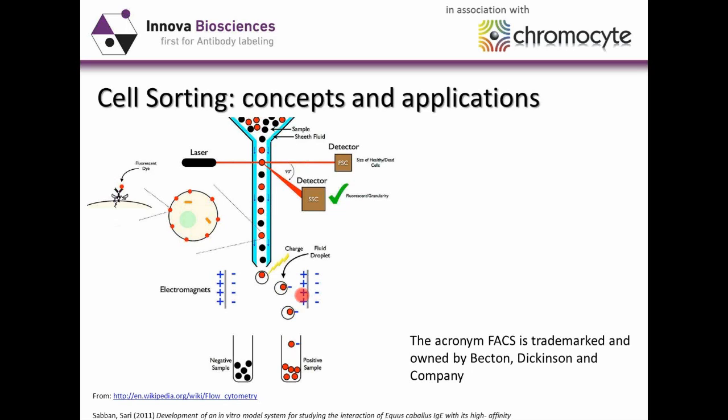Okay, so I hope that's been helpful to you. It's very basic information, but it's important that you get the essentials correct. It's also important that you understand how a flow cytometer works, because there's a tendency these days for the new instruments to take away the need to understand, and it's becoming more and more important to get to grips with the technology that you're using, so you can ensure that the data you're generating and presenting stand up to scrutiny.